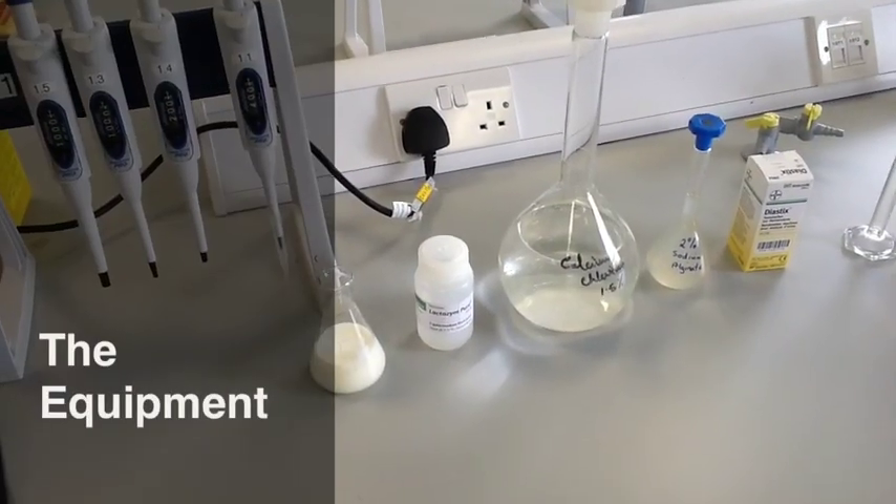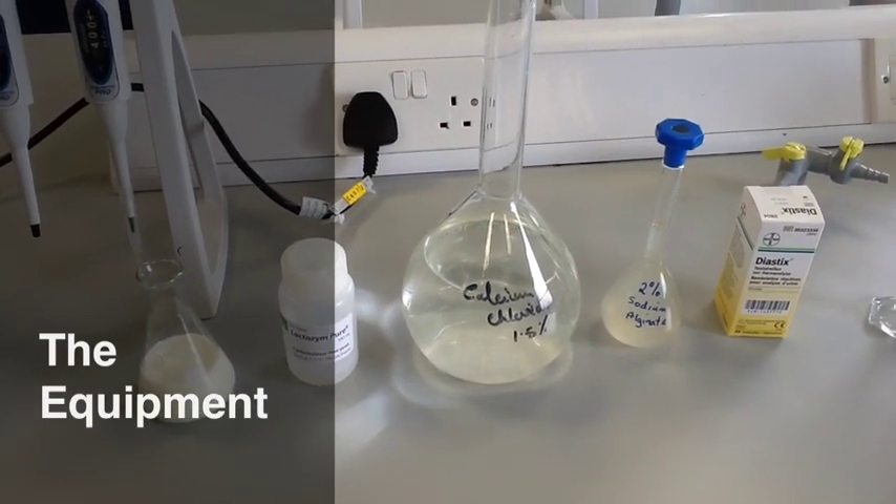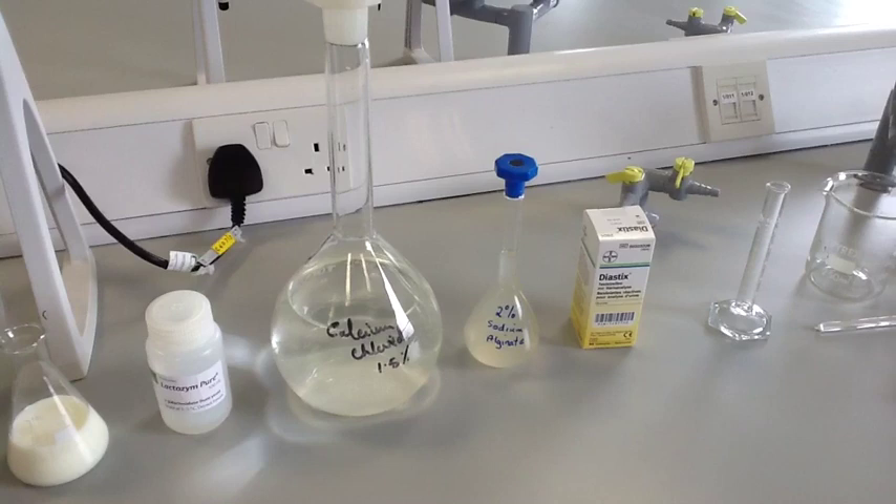The equipment that you will use is: fresh milk; lactase enzyme, which will break down the lactose in the milk into glucose and galactose; 2% sodium alginate solution and 1.5% calcium chloride solution, which are used to make the beads that will immobilise the enzyme; and semi-quantitative glucose sticks — we're using Diastix — to test whether the enzyme has broken the lactose in the milk down.